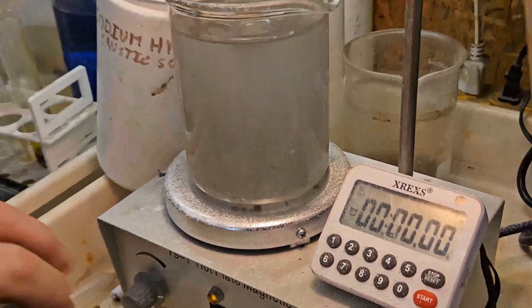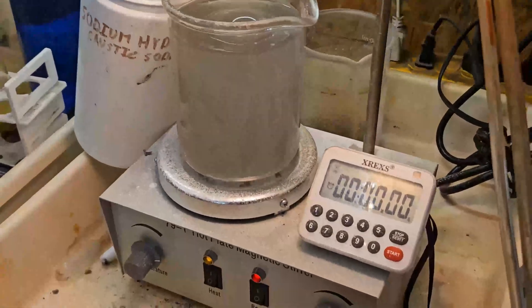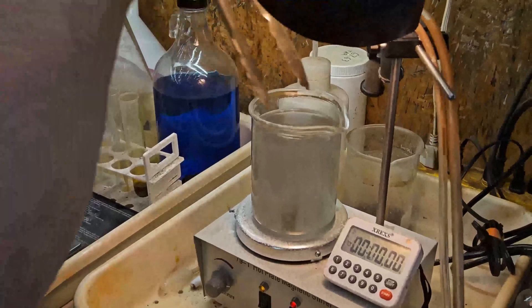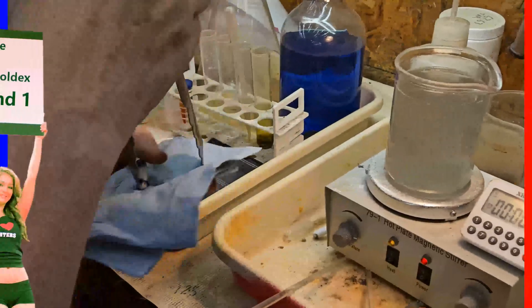We probably should have sifted the Eco Goldex first, as it's a bit like chunks of Portland cement. The Eco Goldex has a lot of iron in it, so we pull it out with the stirrer magnet — otherwise it will make the solution cloudy and the gold leaf hard to see.